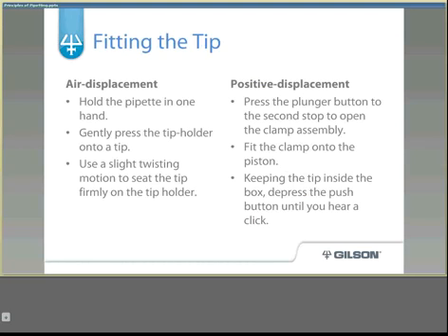There are two different methods for fitting a tip. For air displacement pipettes, hold the pipette in one hand, then gently press the tip holder into a tip. Use a slight twisting motion to seat the tip firmly on the tip holder. Make sure not to hammer a tip onto the tip holder, as this can cause bending or breaking of the tip holder, bending of the piston assembly affecting accuracy, and can make the tip extremely difficult to eject.